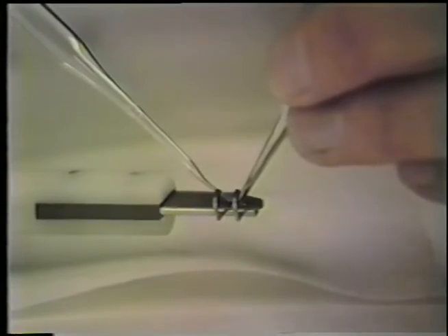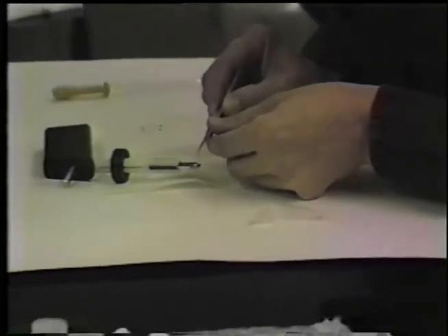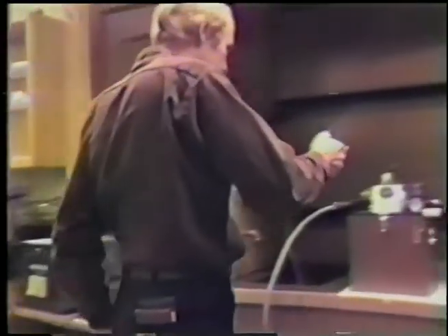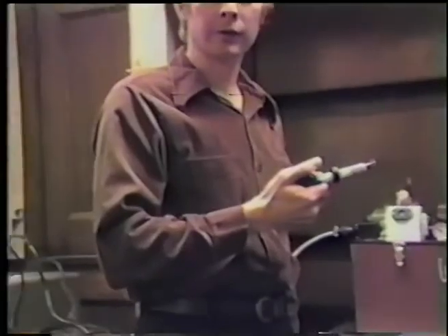So this would be a more reasonable speed in which to prepare a sample. Close it, pick it up, carry it over to the machine. That's the entire freezing procedure.